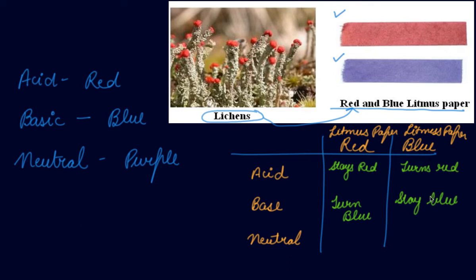For a neutral solution — such as a salt and water solution — the red litmus paper will turn purple or stay red, and the blue litmus paper will either turn purple or stay blue. This is how you identify a neutral substance.